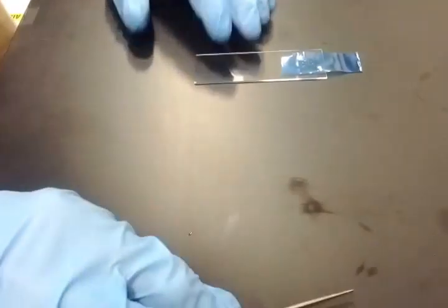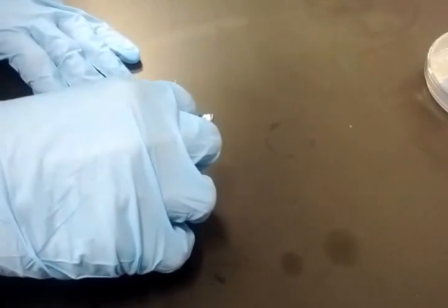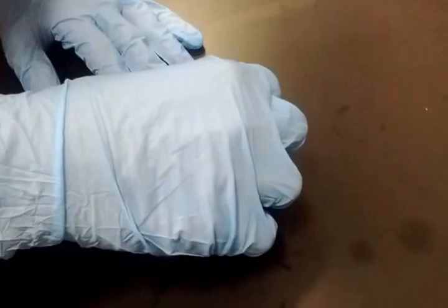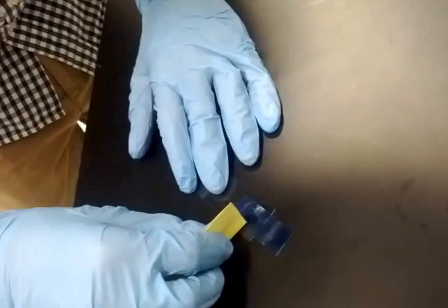Okay. Now I'm going to use something weak like this Post-it, such that the pressure is minimal. This is how I'm going to apply pressure. And I usually wait for a little bit, for maybe half a minute or a minute.